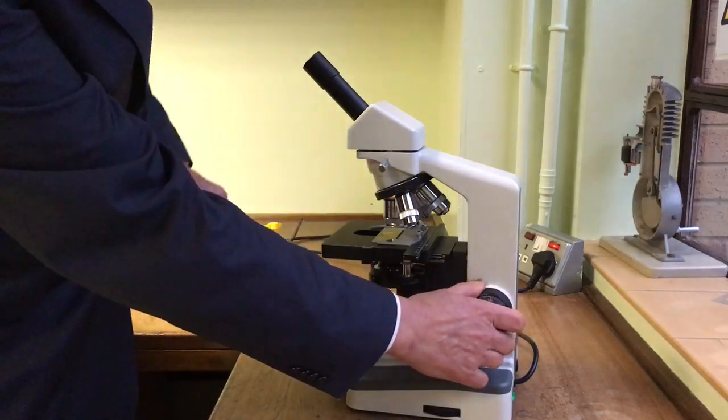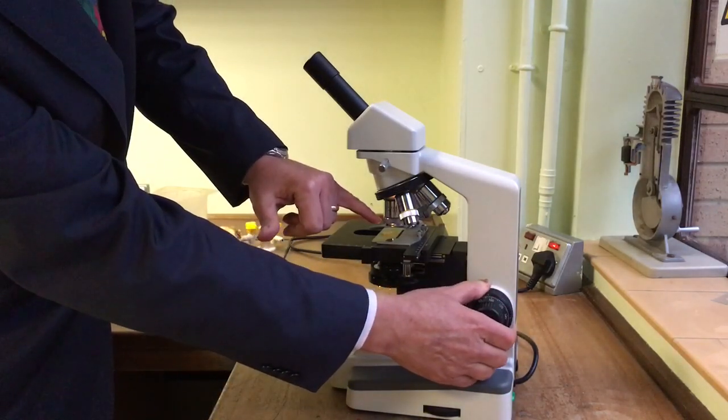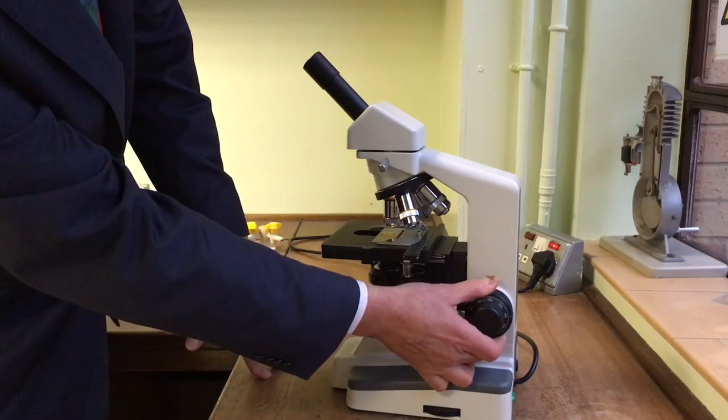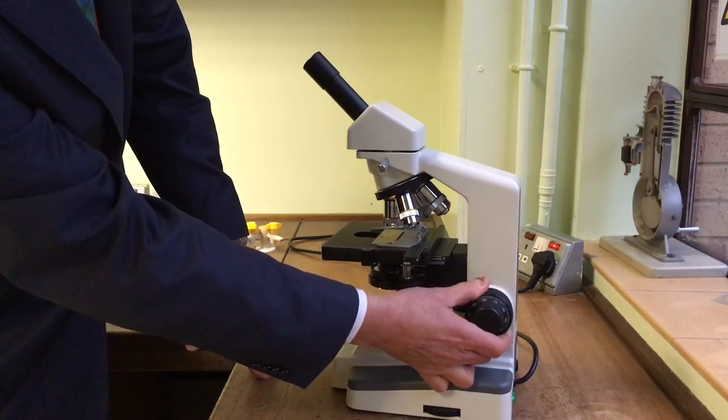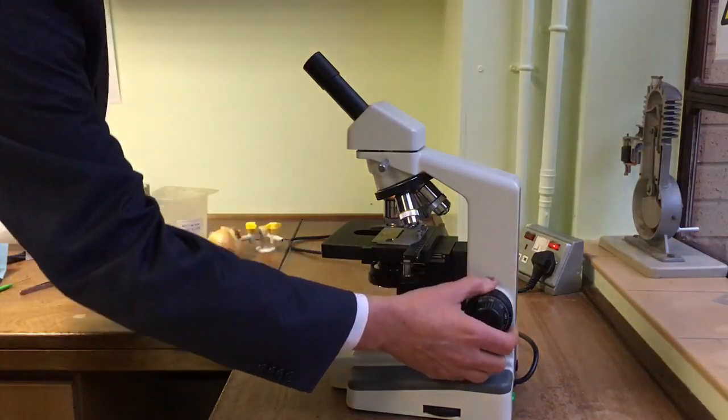While looking at the slide, I'm winding with the coarse focus so that the slide is as close to the lens as it will come. Then I'm going to look through the eyepiece and focus downwards using the coarse focus until it's nearly sharp.